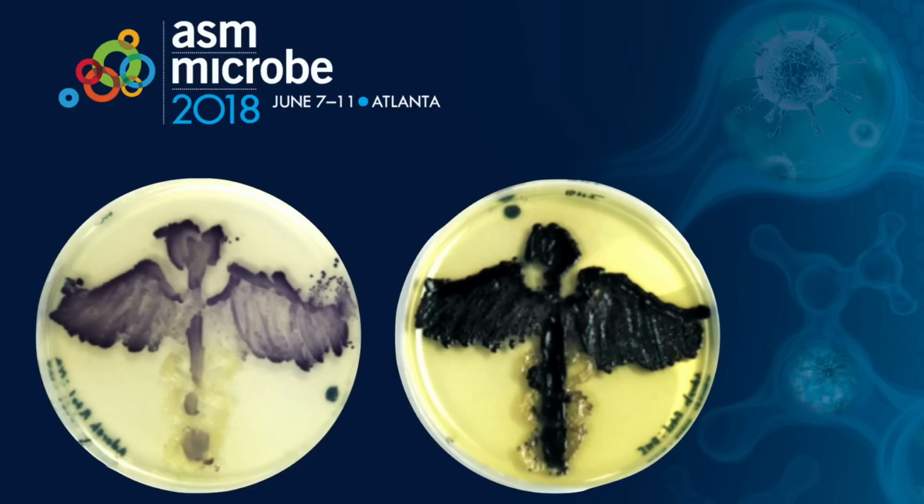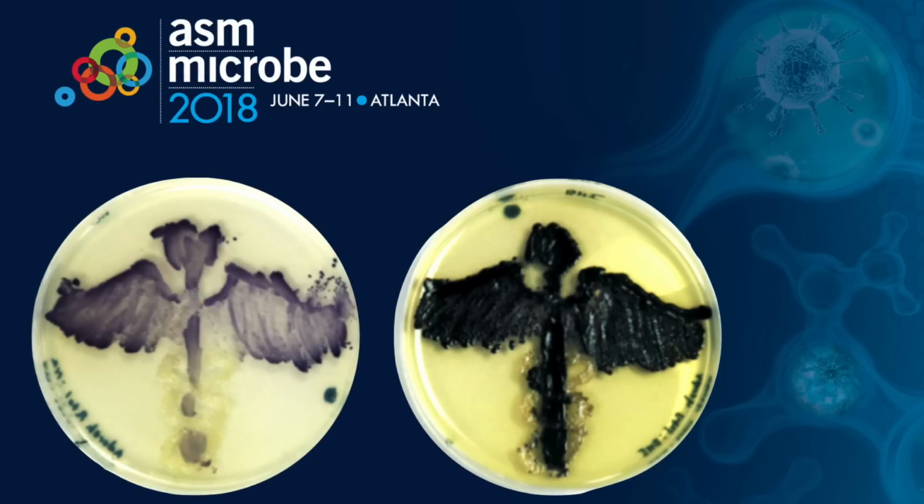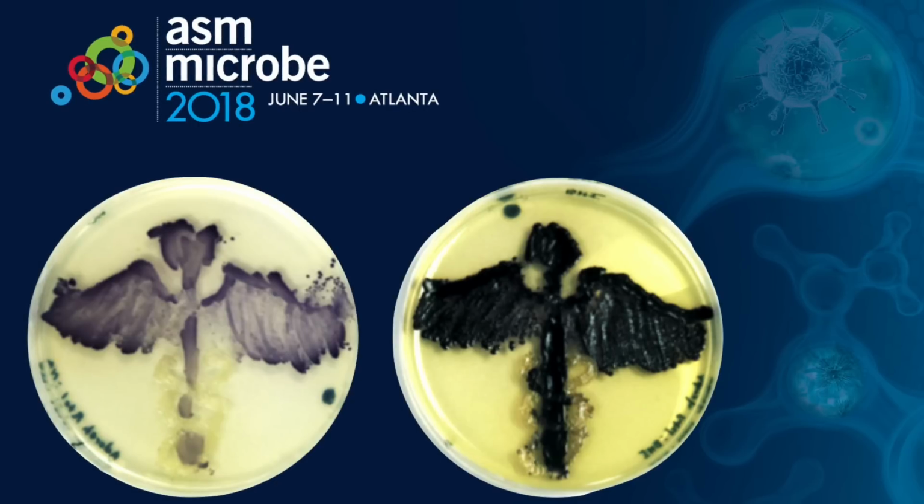So what you're looking at here is this student made a caduceus, right? It's a medical student or a pre-med student. And you can see that it produces almost a black pigment on the BHI plate on the right, but it kind of erratically produces the color on the left. And what you don't know is that there's other microbes on here as well. And you can see that the presence of the snake microbe in here seems to be altering the pigment production of the Chromobacterium on the left plate, which led them to think about why that is and to work on that.